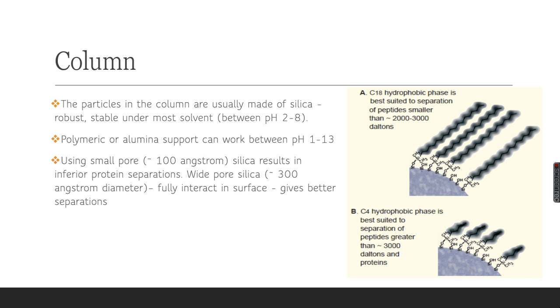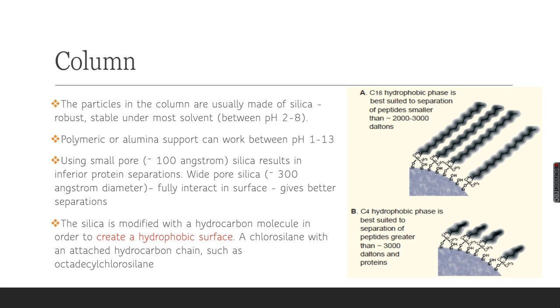Similarly, when we do the functionalization, you'll see that some of the silica surface silanol groups, SiOH functionalities, are not really capped, because the C18 hydrophobic phase cannot reach them; there is too much crowding, which inhibits the functionalization of some of the silanol groups. So in that scenario, we need to cap them.